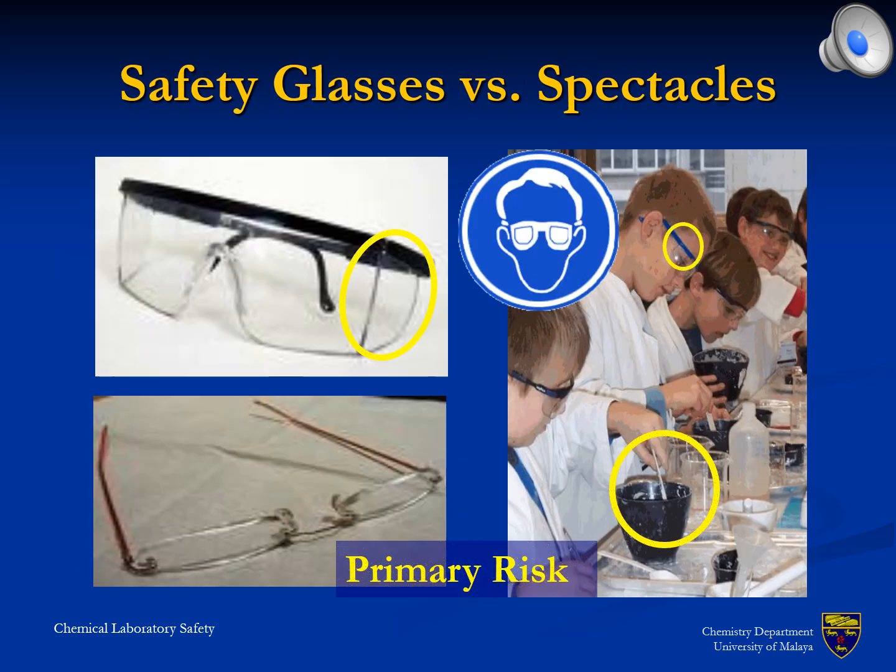Safety glasses cannot be replaced with spectacles. The key feature of safety glasses is not, as widely assumed, the front window, but the side protection. The human eye is naturally protected by the eyelid, which closes automatically upon anything approaching. However, this protection scheme only applies for the front view, where the attention of the eye is directed to. A spill from the side will not be recognized and can, hence, easily enter the eye.